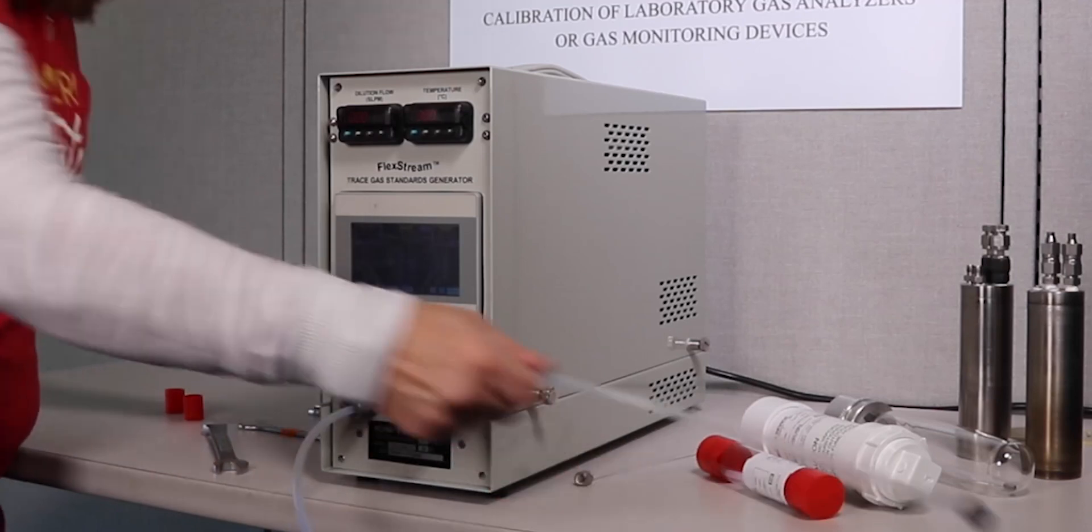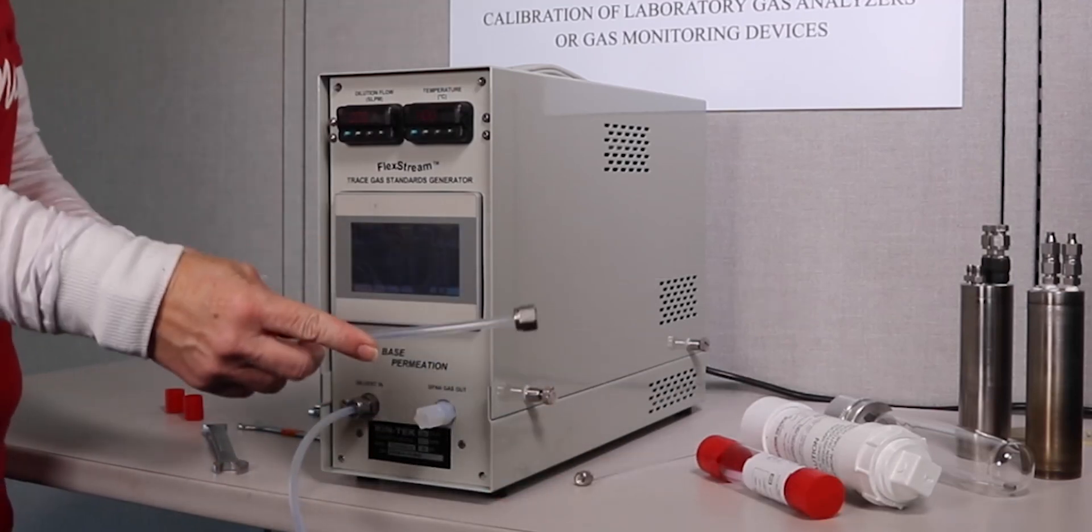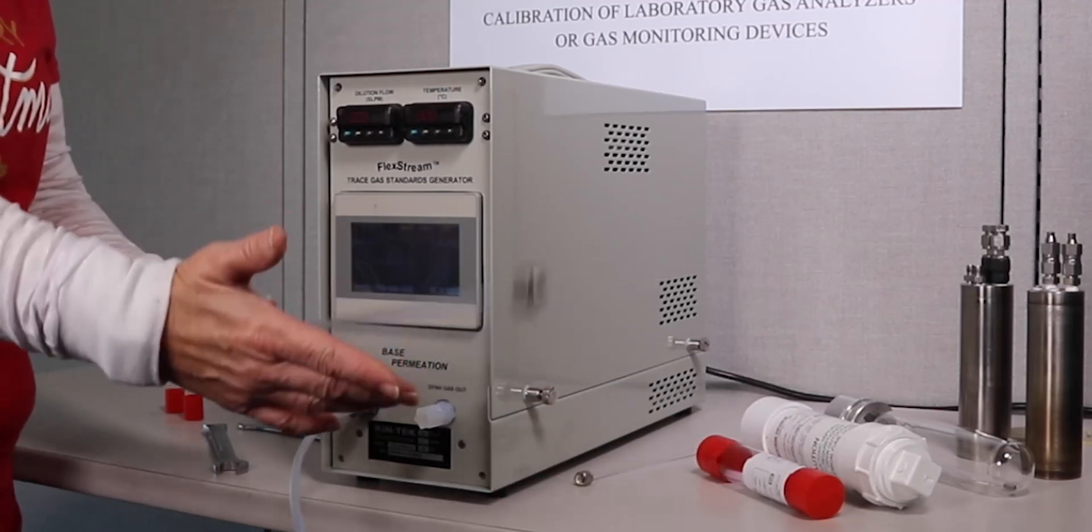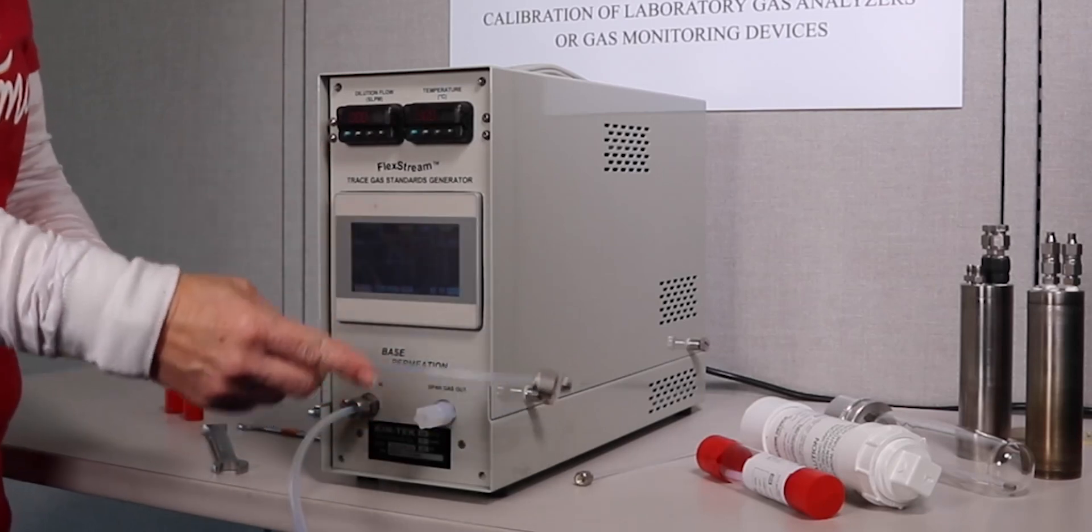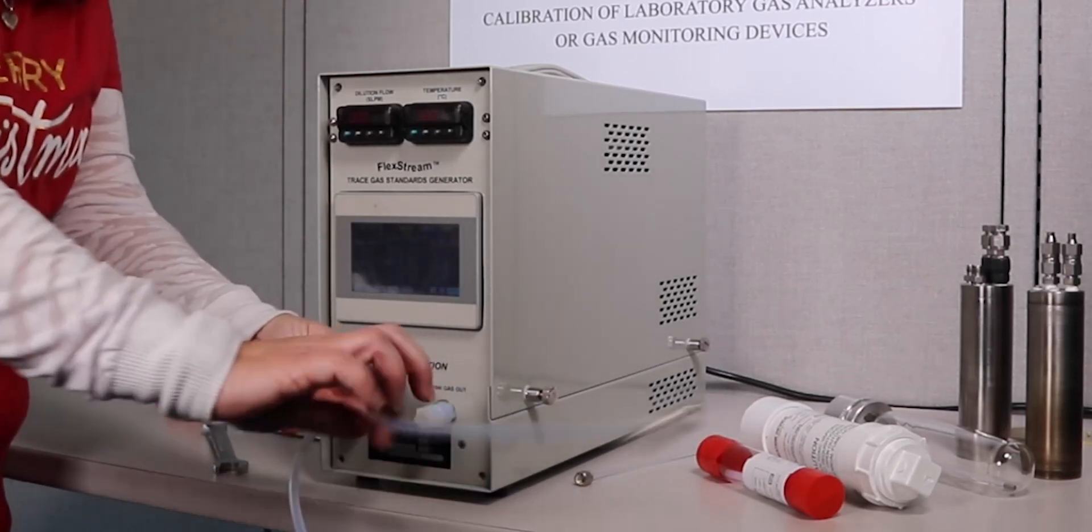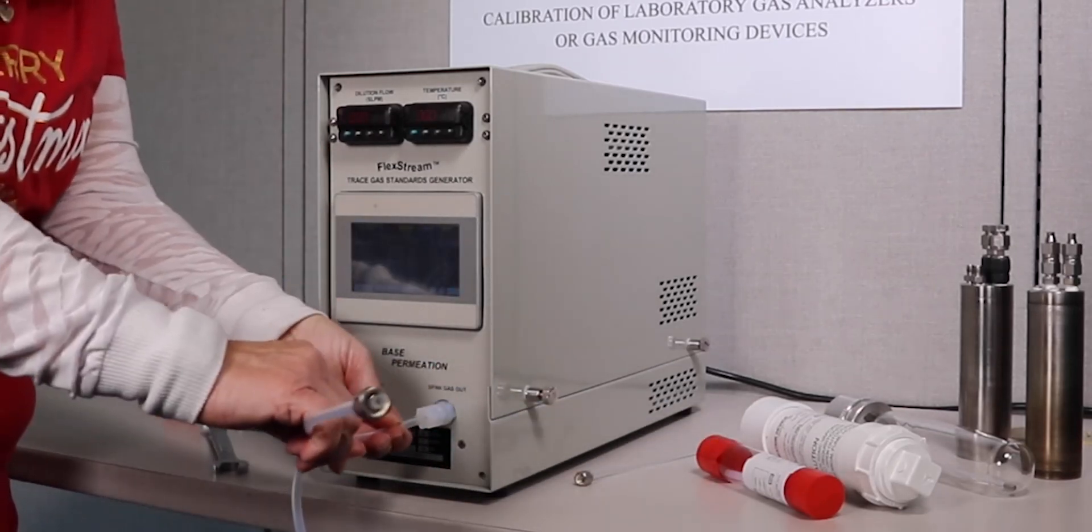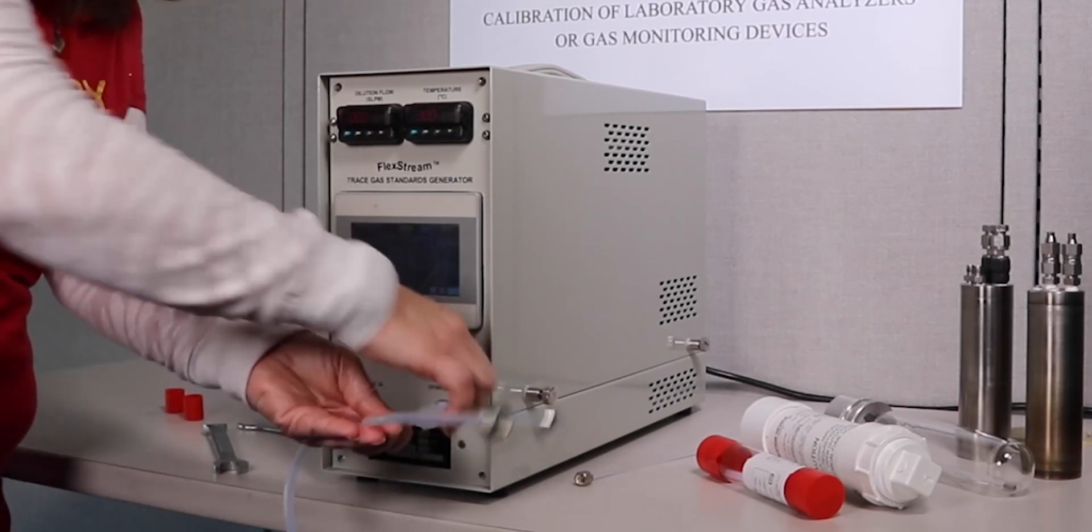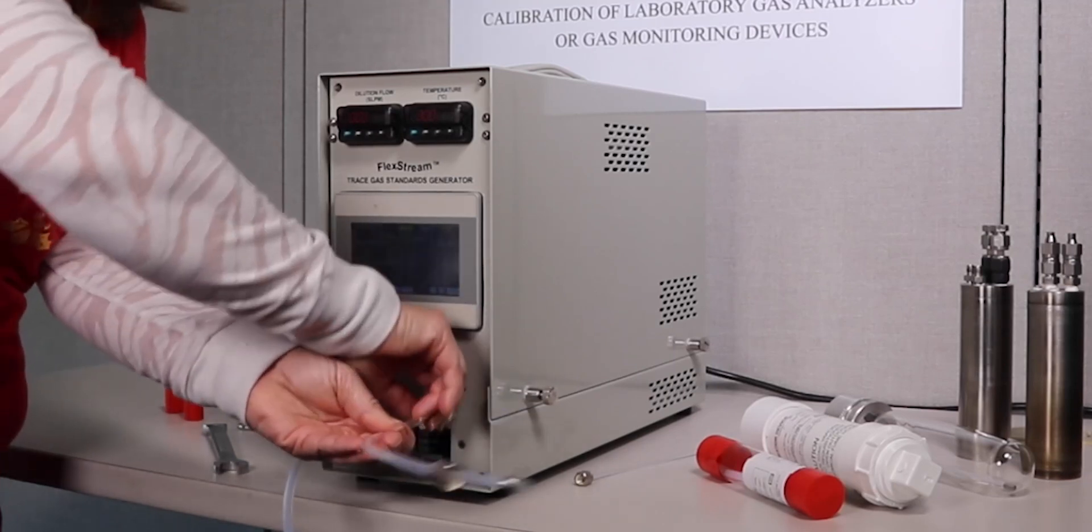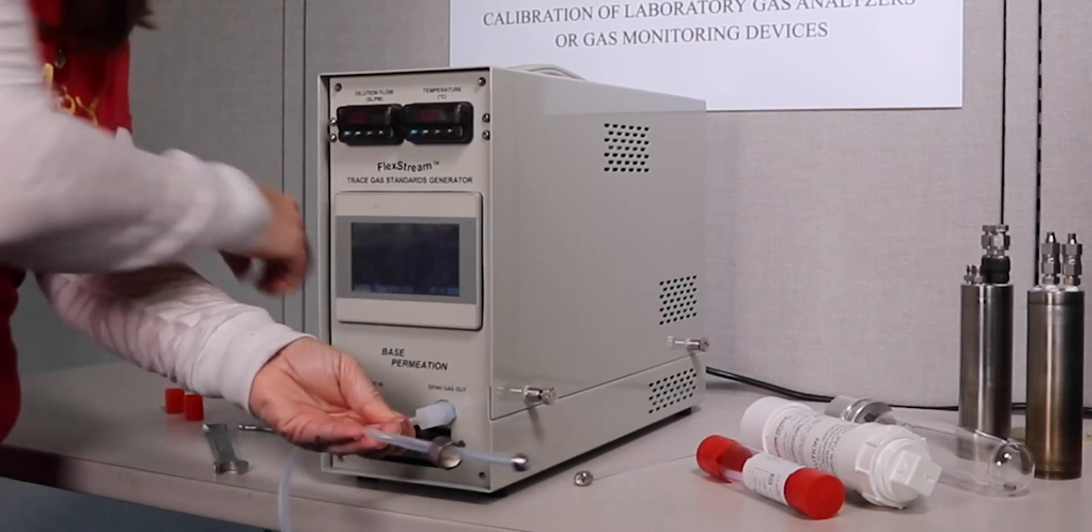I then have an output line that I want to connect. This would actually connect to an analyzer or a detector or any type of device under test. Again, I'm using quarter inch Teflon tubing. I slide this into the Teflon fitting and I use a 5/8 wrench to tighten this.